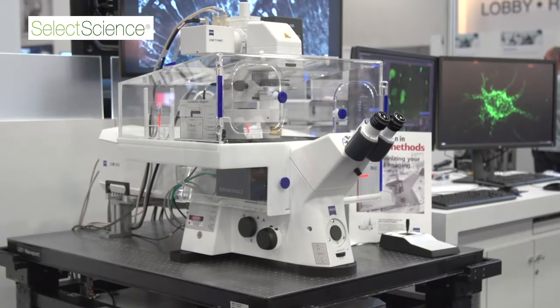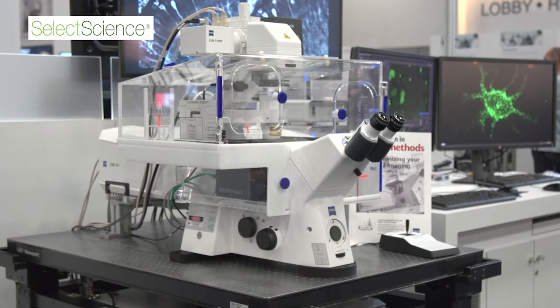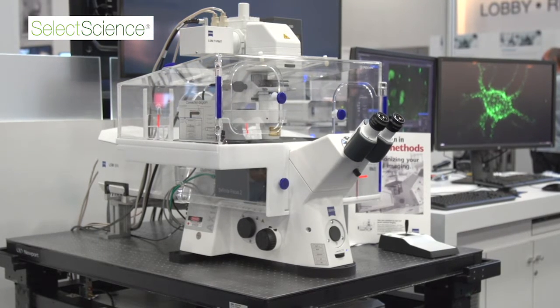What we have here is our LSM 880 80ScanFAST. It's our eighth generation of confocals, and this instrument is specifically designed for doing dynamic live cell super-resolution imaging. The 80ScanFAST came out about two years ago, and the FAST mode gives us four times faster imaging speed with the same super-resolution and sensitivity that was the hallmark of the 80Scan detector.